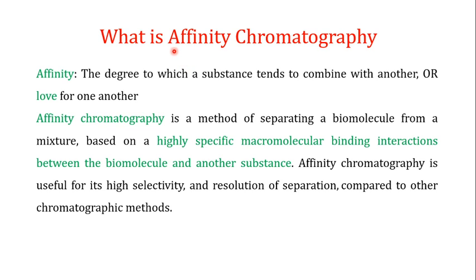Now what does the term affinity mean? Affinity is the degree to which substances tend to combine with one another. Say, if there are two things, what is the degree of tendency to which these substances combine with one another? Or in simple terms, affinity actually refers to love. If two things have love for one another, they are going to stick to one another.